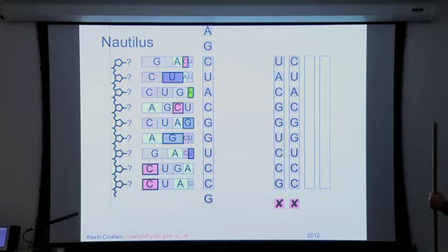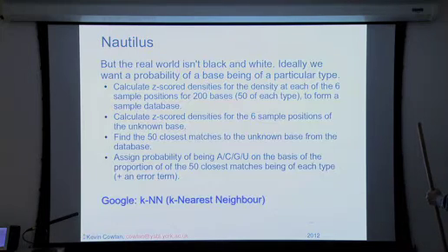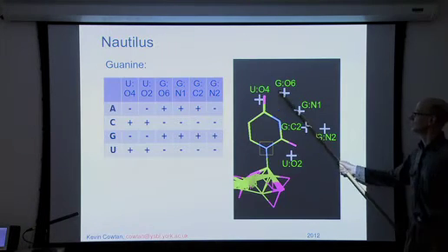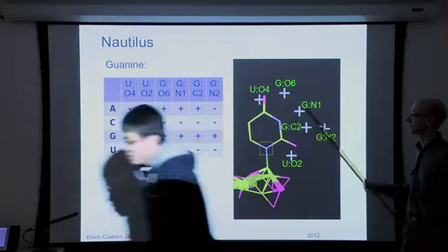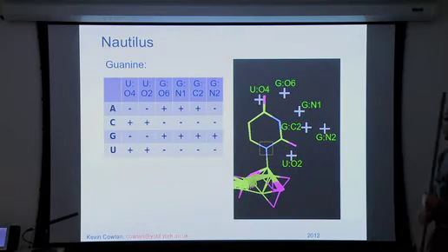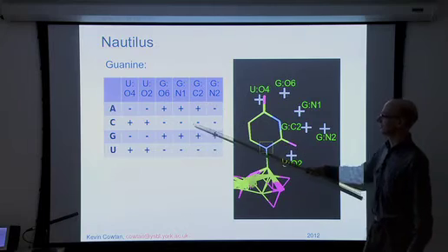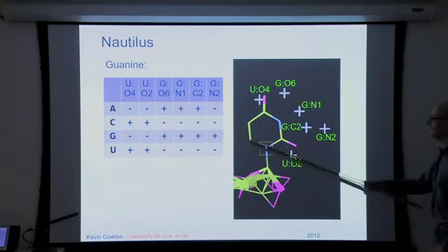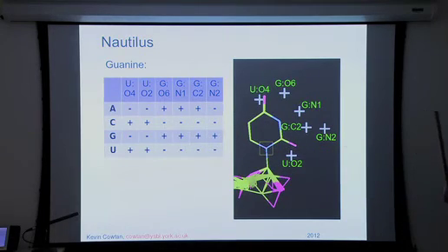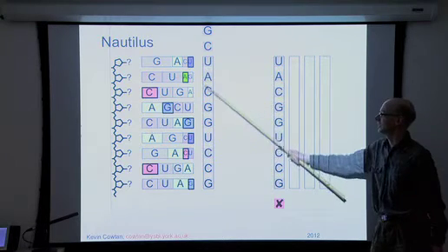But that's just an illustration of how we assign the sequence. There's a set of probe points which are indications of whether we've got A, C, G, and U. We can't tell C from U. We could if it were DNA. I haven't exploited that information yet. But we can certainly distinguish large and small bases, and we can sometimes distinguish between the types. And so that gives us partial information.